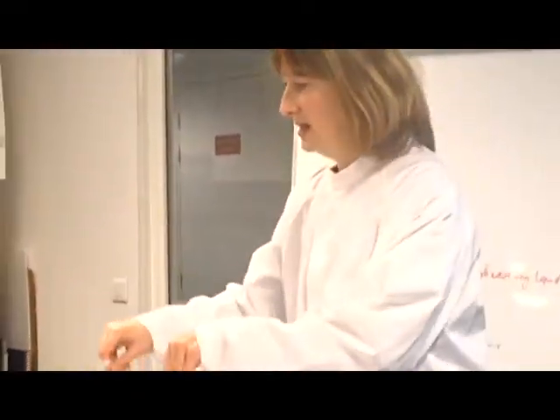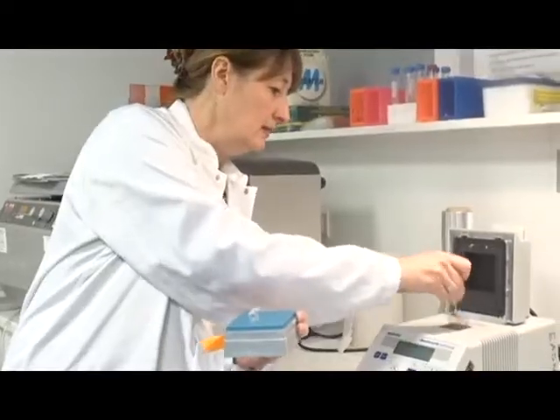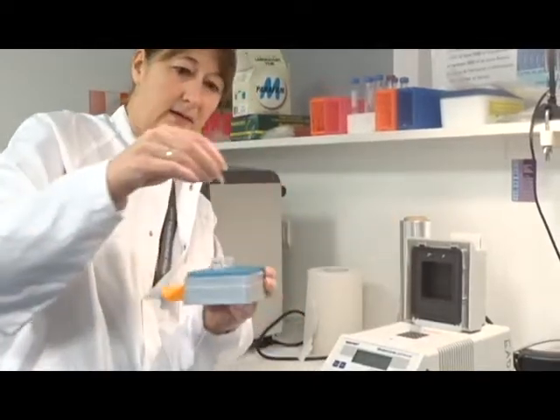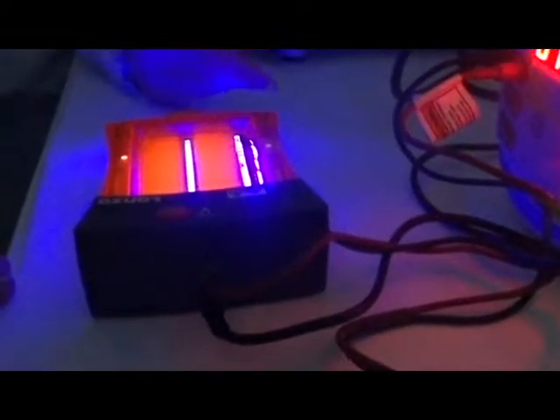To help us visualize these concepts better, our trainers at Genethon had us do a series of experiments. Our first task was to isolate our own DNA from our saliva, which is surprisingly easy and can be done even at home by adding dishwashing liquid, a pinch of salt, and rubbing alcohol. Another experiment was isolating a specific area of our DNA and amplifying it in order to analyze the number of base pairs located there. In the general population, this particular DNA fragment either contains 100 base pairs or 400. The experiment showed that we were a very homogeneous group, as all of us had the short version of the fragment with 100 base pairs.